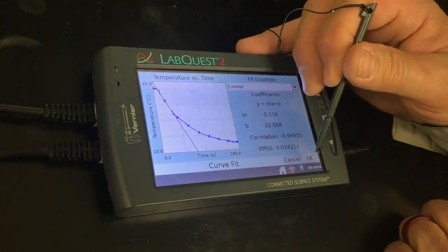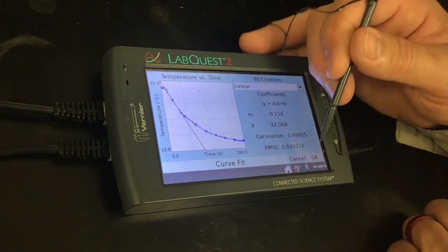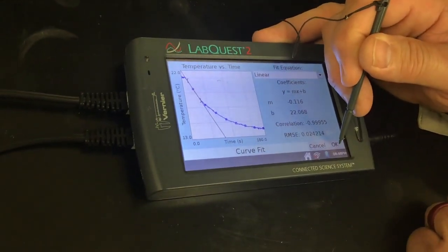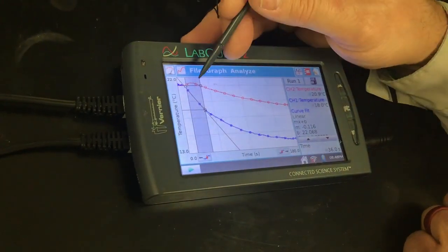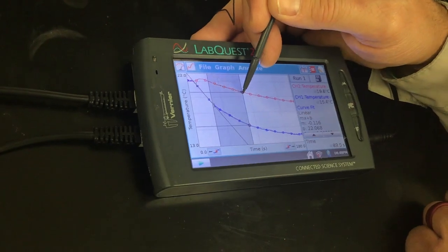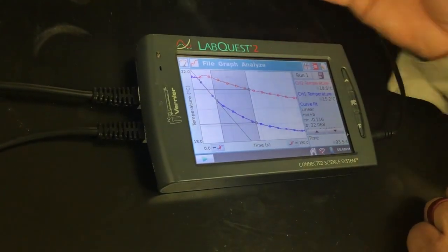Think about how this is going to react. What we're going to want you to do is relate this to intermolecular forces, but this substance obviously is evaporating pretty quickly. Let's go ahead and select a region for the water this time, and I'm going to select right in there for the water. That's pretty good.